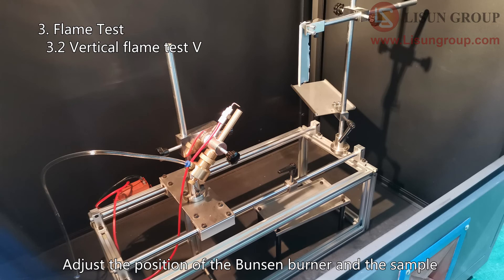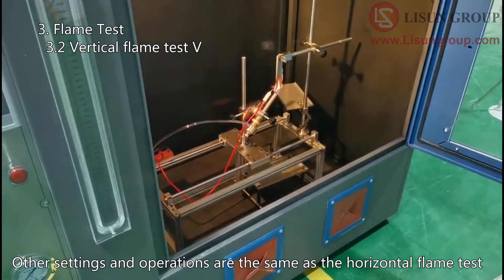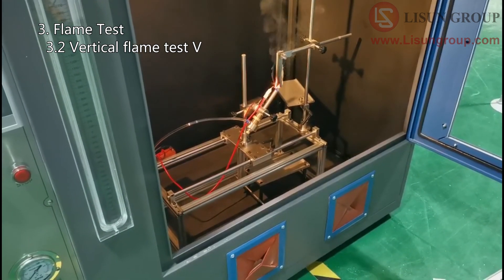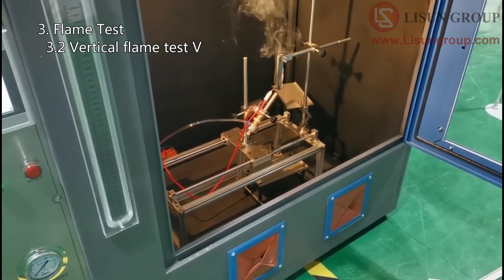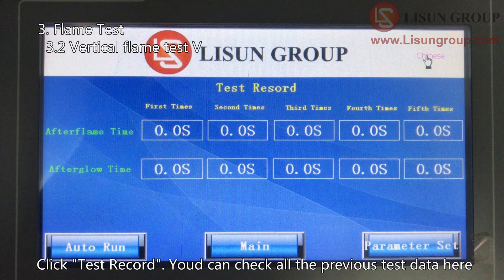Adjust the position of the Bunsen burner and the sample according to the vertical flame test standard. Other settings and operations are the same as the horizontal flame test. Click Test Record. You can check all the previous test data here.